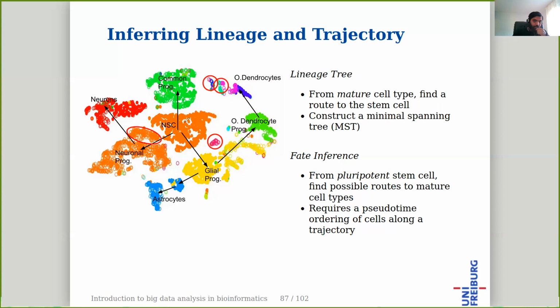For example, maybe you see a gene A which is always downregulated along this path, another gene B that is upregulated here, and another gene C which is downregulated. If you see a common expression pattern, that defines this particular trajectory compared to the others. This is what we are inferring.